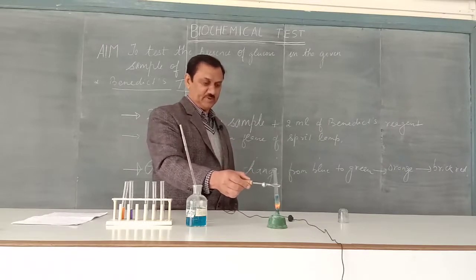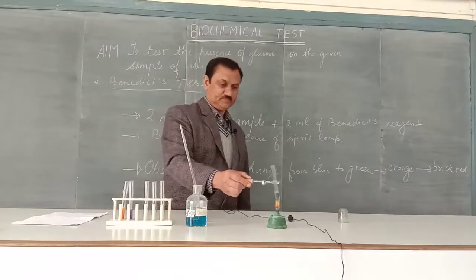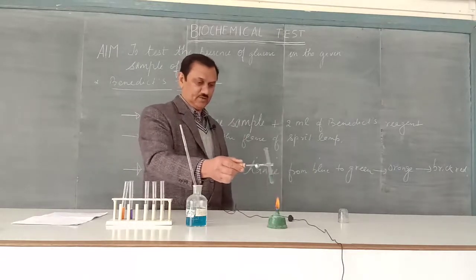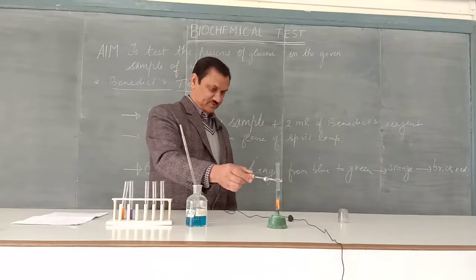Please keep shaking this solution and observe the color change.